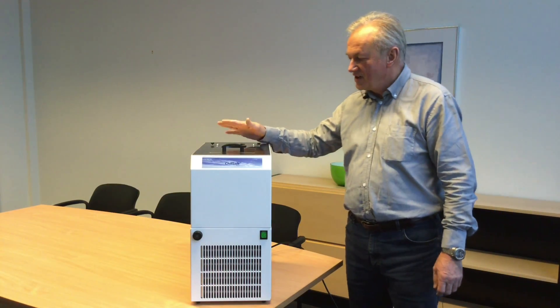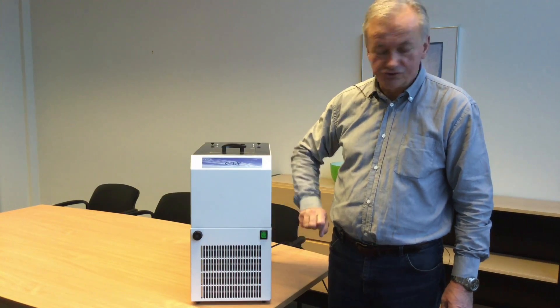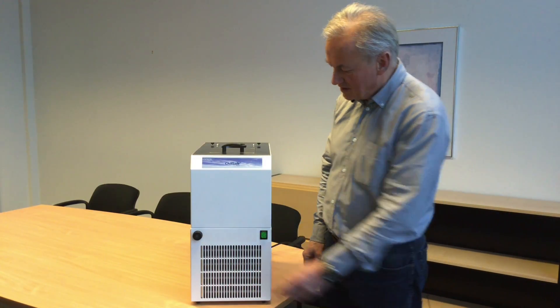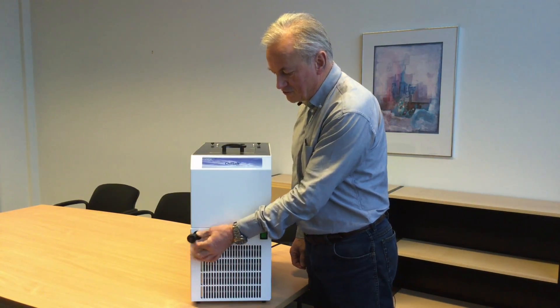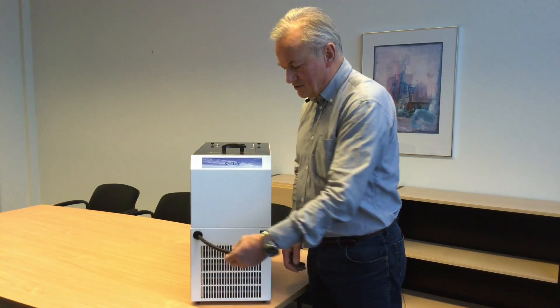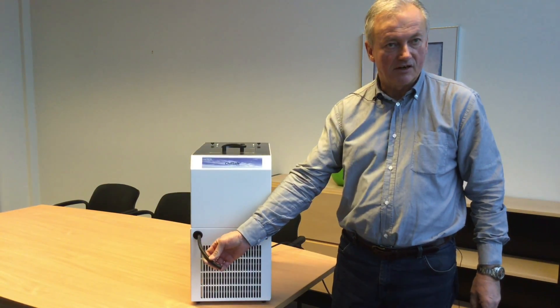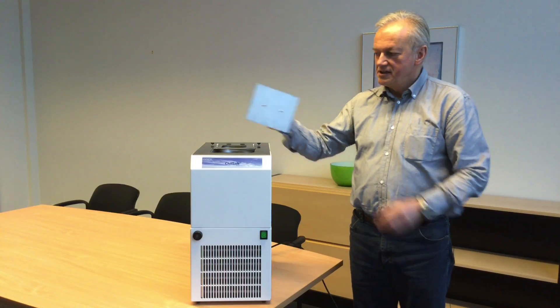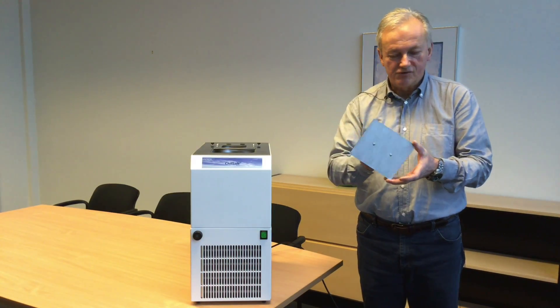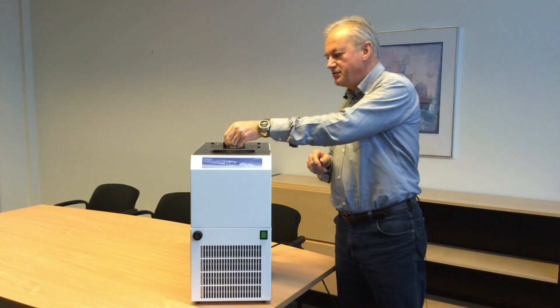The cooling bath itself is actually quite easy to handle. You have an on/off switch to turn on the cooling system, and you have a drain tap to drain the solvent from the inside. You can just pull out the knob and then you can drain all the liquid out of the bath. At the top we have a lid that is to prevent too much evaporation if you are working at a slightly higher temperature.